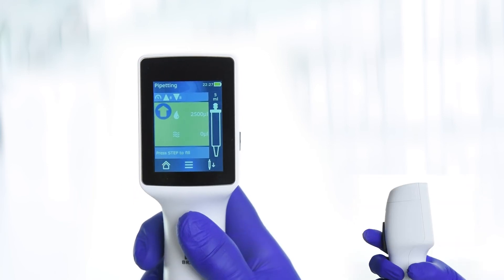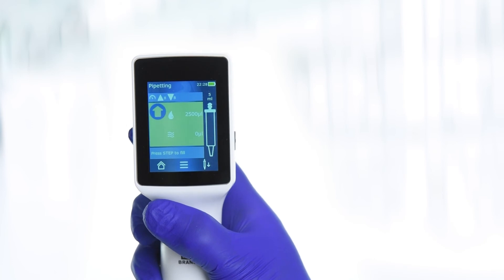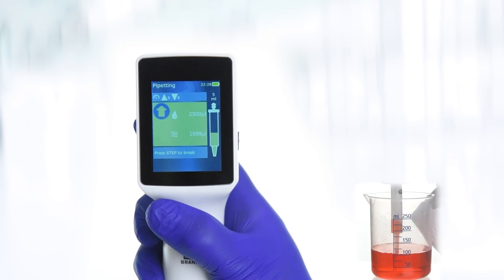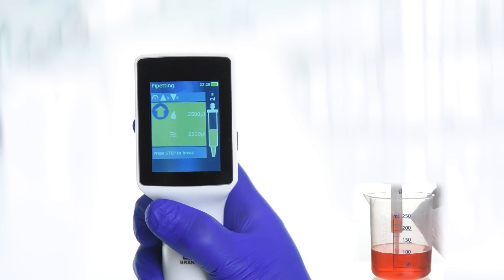Press the Step key to aspirate. The Pipet screen menu or the operating screen displays the dispensing volume and approximate volume in the PDTip. Press the Step key to dispense.